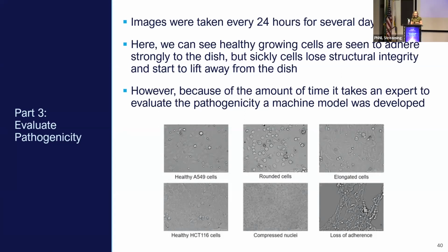And what would normally happen is a subject matter expert, so a microbiologist who's very good at microscopy, would look at the microscopy images of the human cell line that has some unknown bacteria. They would figure out the patterns that they know as a subject matter expert and be like, oh, this one's infected, this one's not. But for looking at an entire soil, or in this case, permafrost sample, there's going to be way too many because we're checking over way too many unknown bacteria.